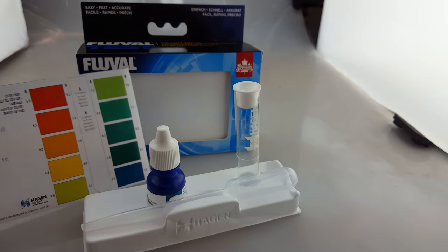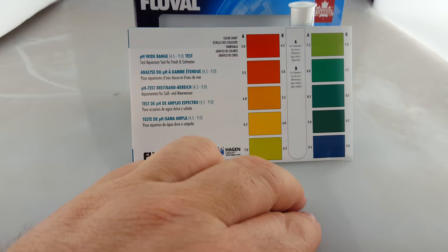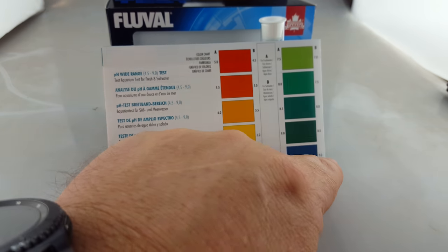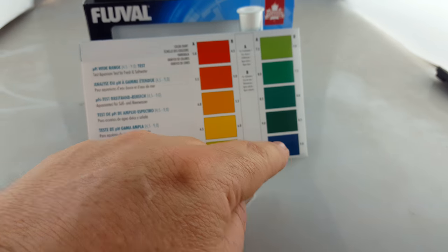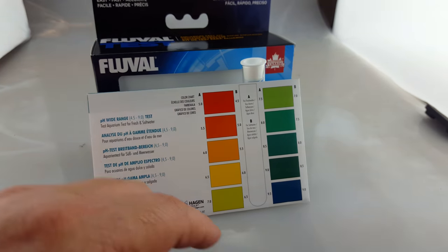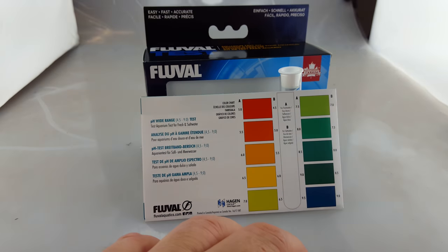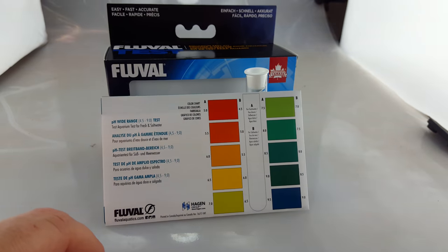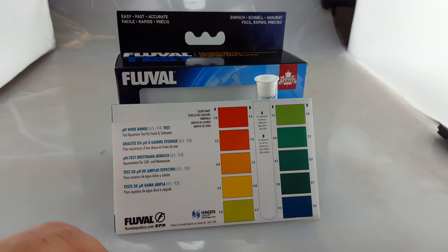When it comes to the colour chart, your colour chart is nice and simple. It will range anywhere from 4.5 through to 9 and then you've got the colour gradient to work through to determine what you've got. It's just one kit, so it's not a matter of where you've got to work out whether you need a low range pH test kit or a high range pH test kit. It will work for water anywhere from 4.5 through to 9.